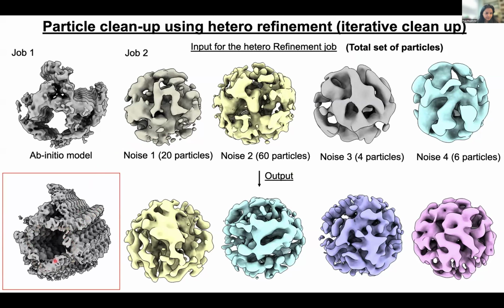So then we asked what is the biological significance of this huge filament network formation. In order to do that, we decided to break the interfilament association by mutating the interacting residues. As this was a backbone interaction, we deleted one residue from filament 1 from the CARF domain and 2 residues from filament 2 from the TIR domain. And we checked that by mutating these residues, we could actually prevent the network formation on the grid.